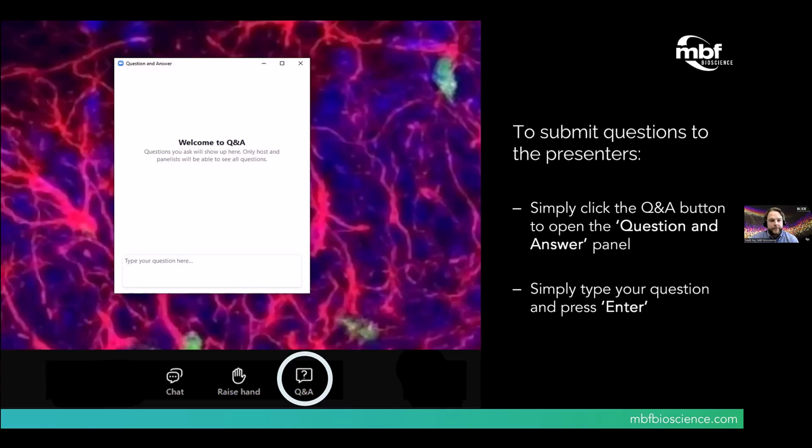See another question here about how to mount whole mouse brain samples. So on the slice, we use cuvette-based mounting systems. We're just using standard off-the-shelf cuvettes that we've customized attachments and components to couple those cuvettes to our stage. We have different sizes of the cuvettes available.